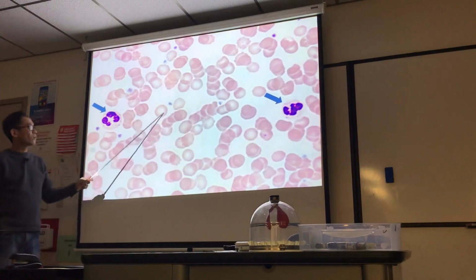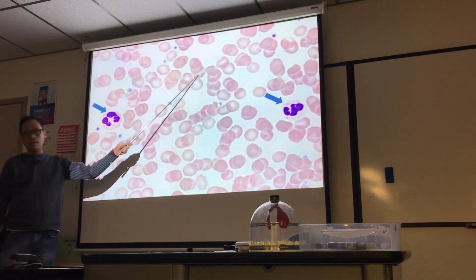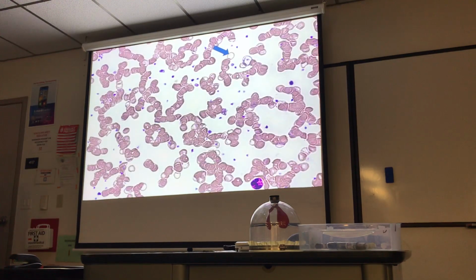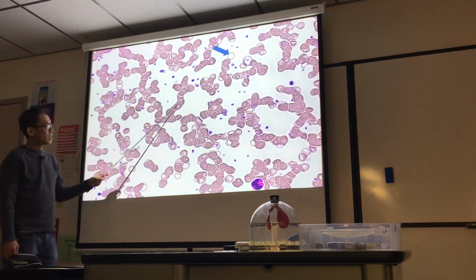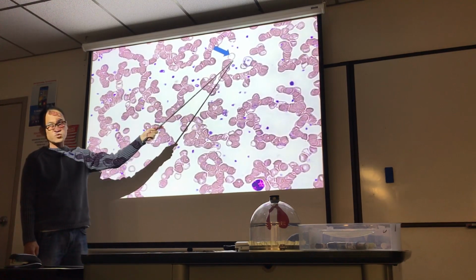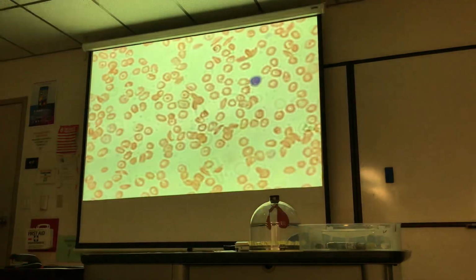But what if I pointed to that little fragment? Platelet, and any of these, red blood cell. Okay, that's a possibility. And this condition, iron deficient anemia, I see a bunch of platelets. The decreased hematocrit, the cells are kind of clumping together. There's a microcyte, the more translucent red blood cell. Microcyte.